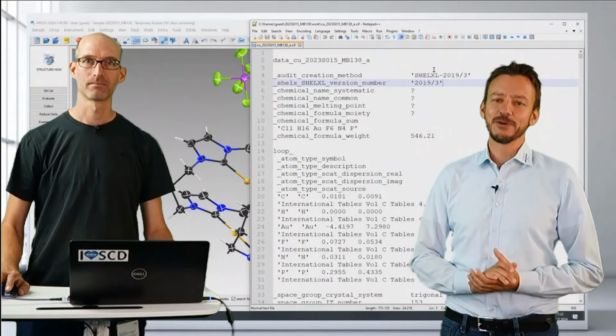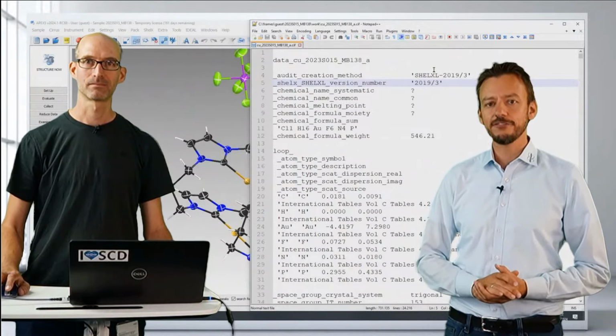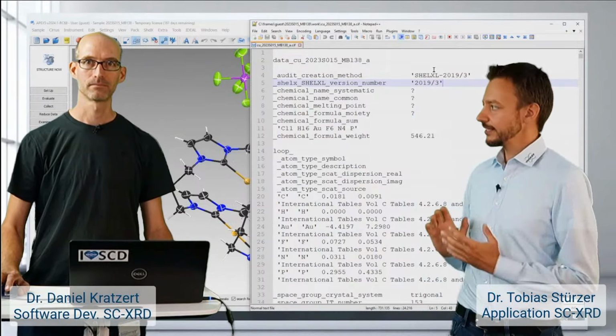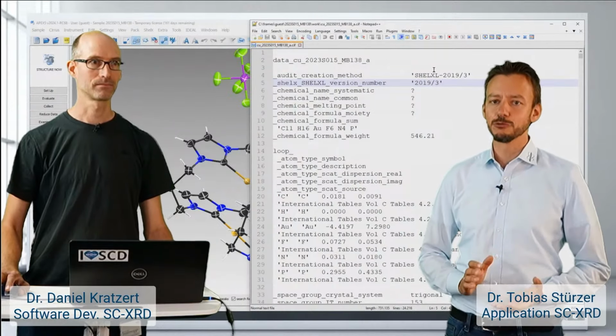Hi everybody, and welcome to our seminar on a new report functionality in Apex 5 based on the great program FinalCif. With me today is Daniel Kratzert, the author of FinalCif, and my colleague here at Bruker.